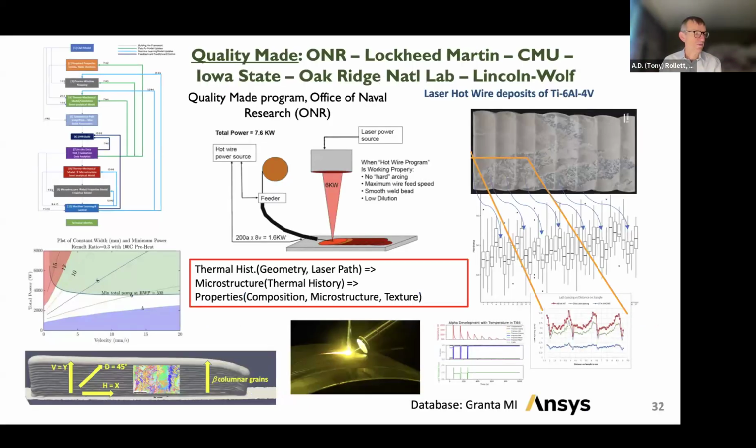All right, so for a few minutes, I will explain why large area EBSD is not only necessary, but actually pretty interesting. This slide summarizes a lot of the aspects of the laser hot wire project that we were involved in. The laser is much bigger than you find in laser powder bed. It was a 6 kilowatt laser.